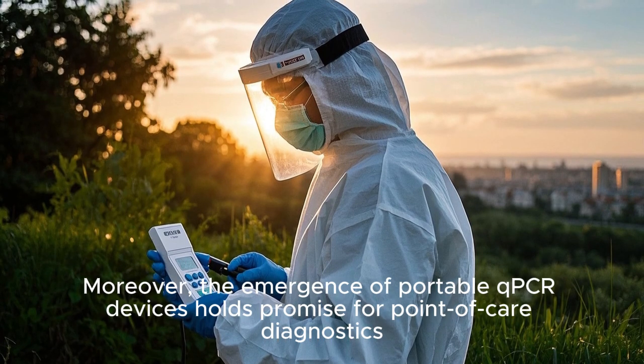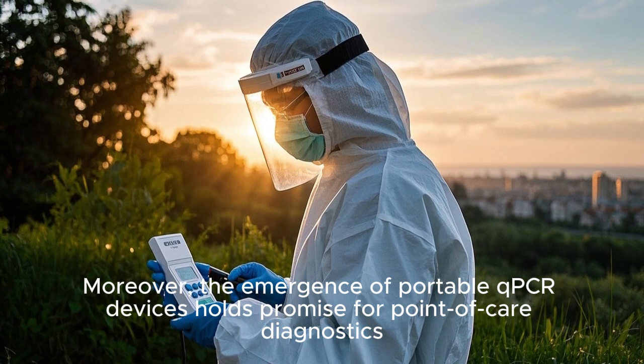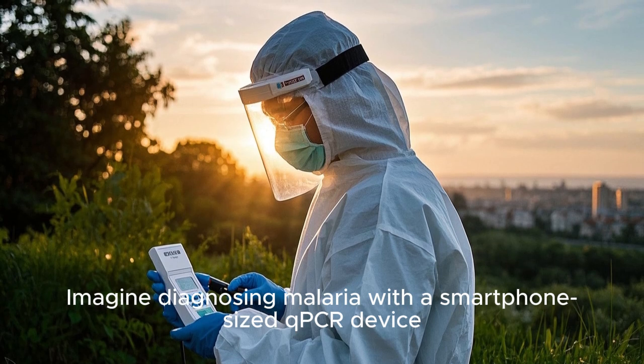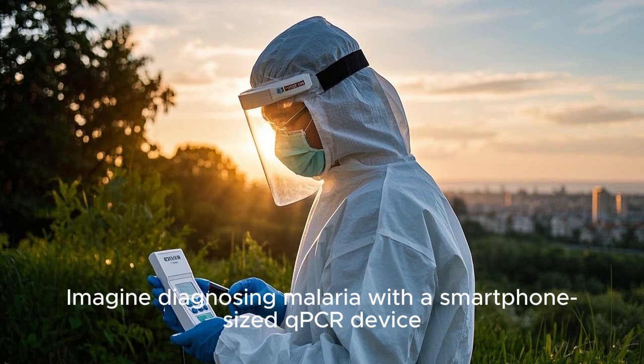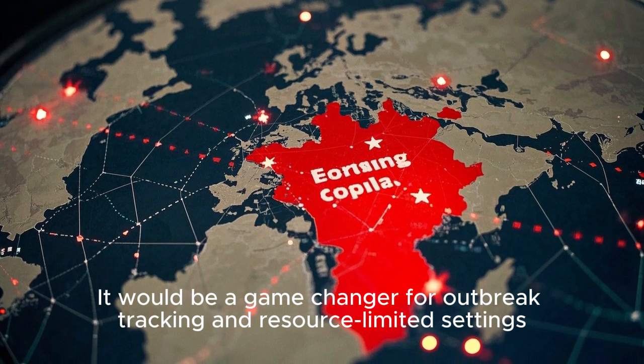Moreover, the emergence of portable qPCR devices holds promise for point-of-care diagnostics. Imagine diagnosing malaria with a smartphone-sized qPCR device. It would be a game-changer for outbreak tracking and resource-limited settings.